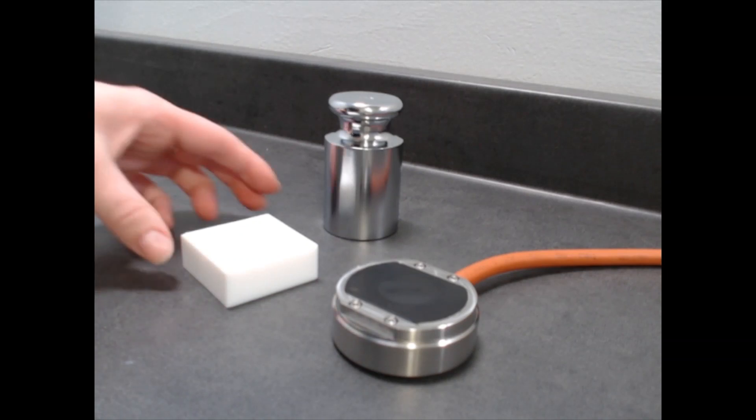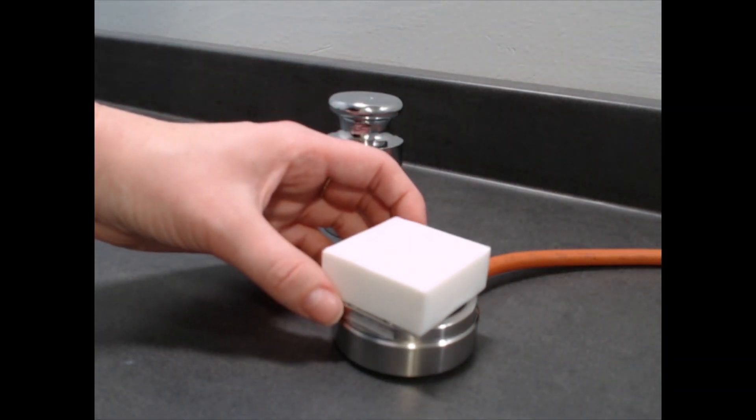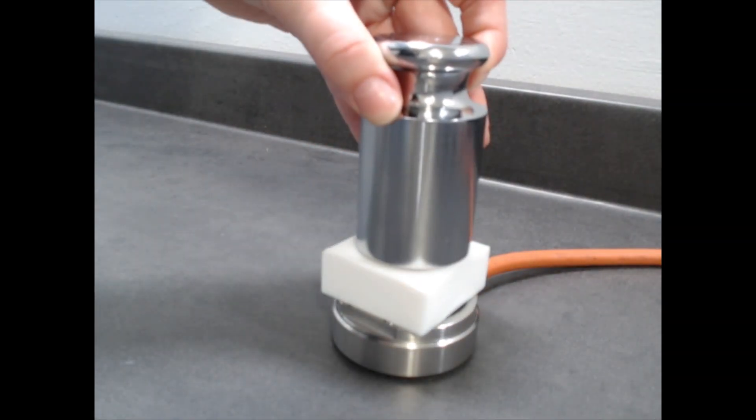To set up a measurement, you just have to take one piece of sample and place it on top of the sensor, making sure that it's centered, and then place a one kilogram weight on top of it to ensure good contact between the sample and sensor.